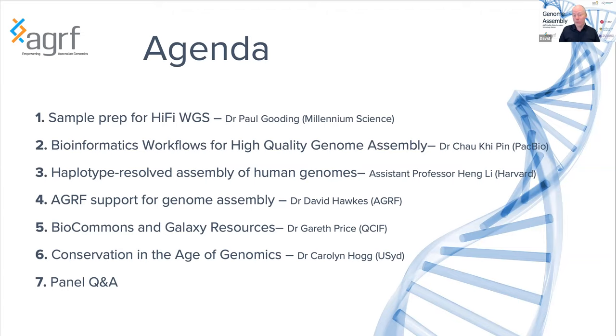will dive into resources that are available through BioCommons and Galaxy Australia that will help you with your genome assembly projects. Lastly, to round out the session, we have Carolyn Hogg, who will present her real-world experiences with genome assembly from PacBio data. Finally, we'll end with an open panel discussion.